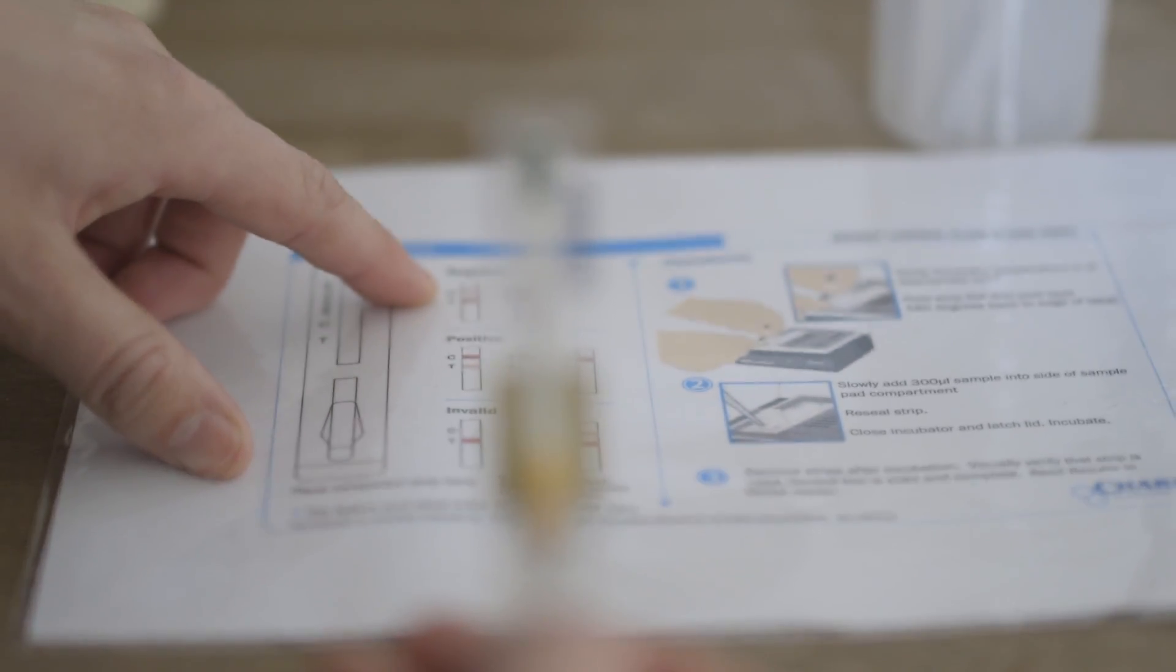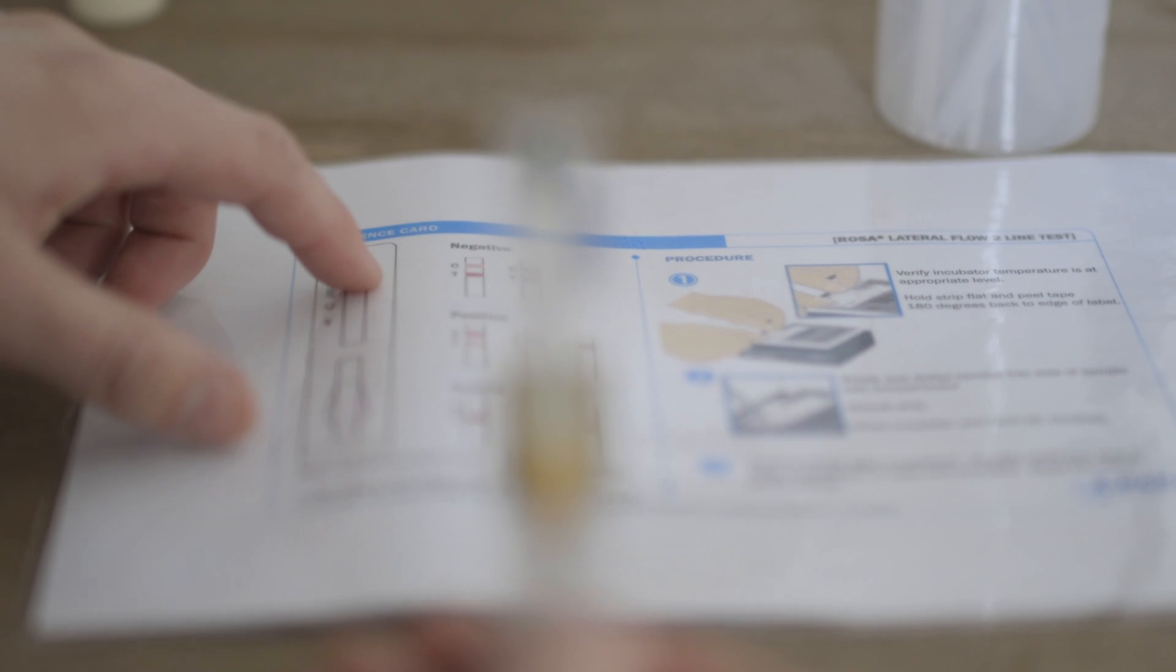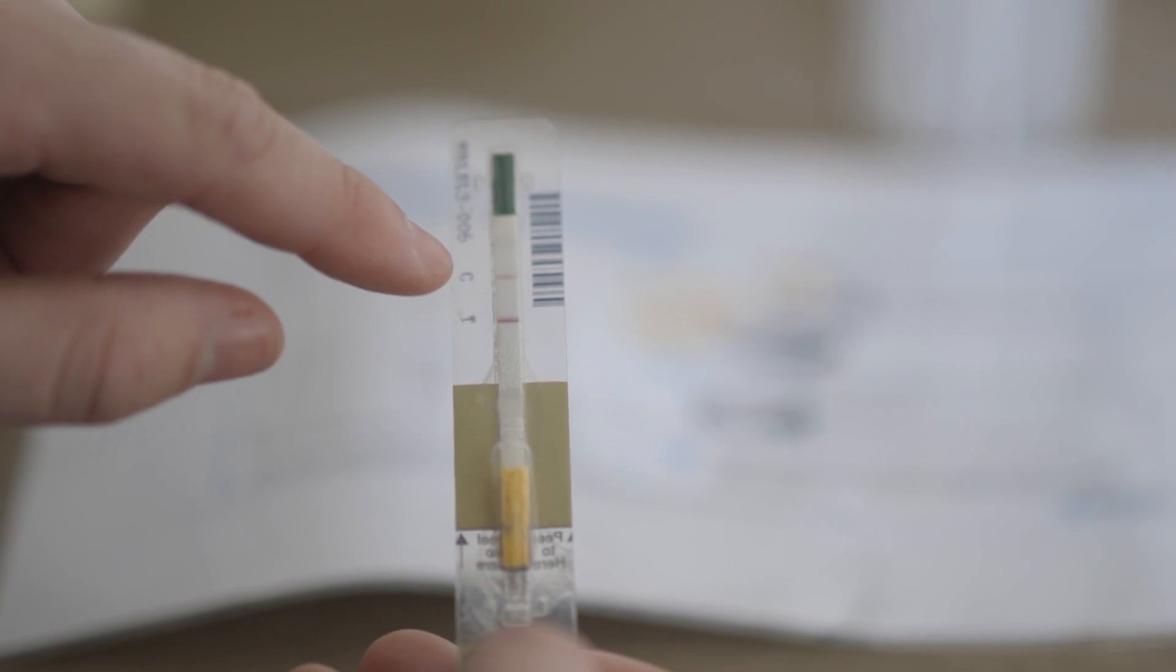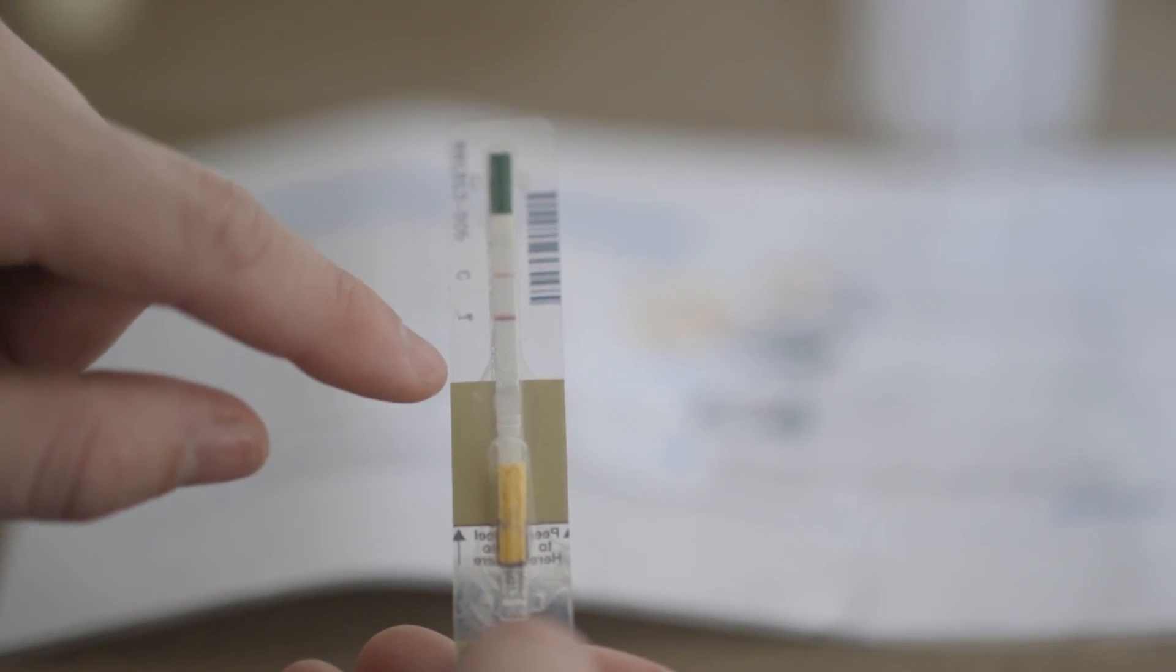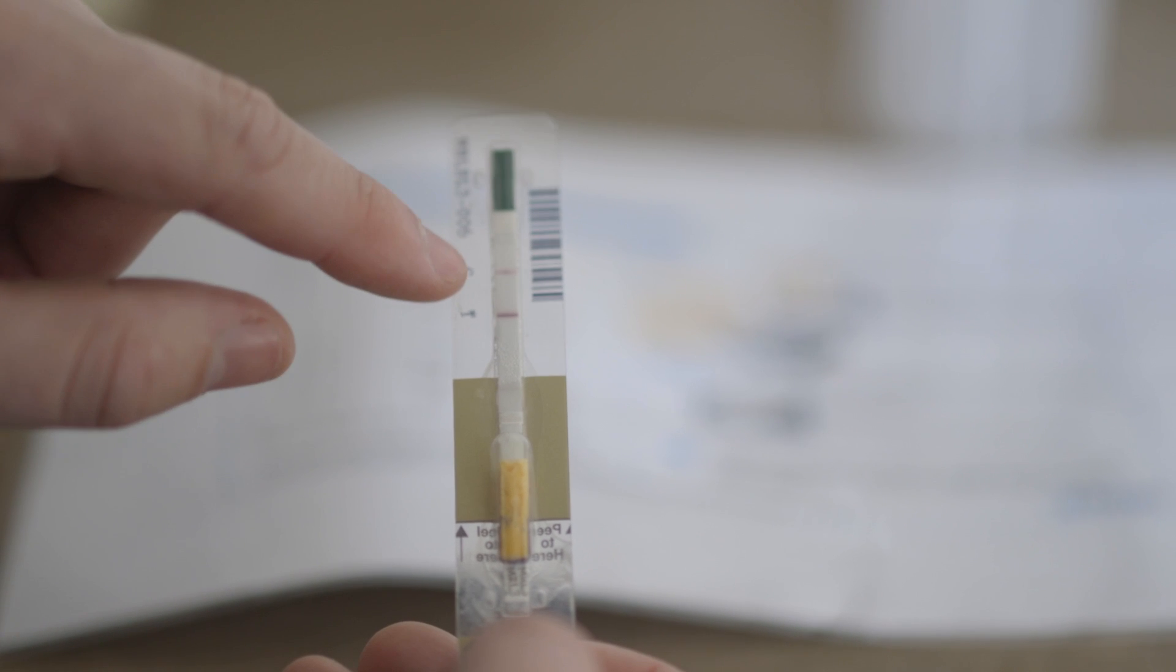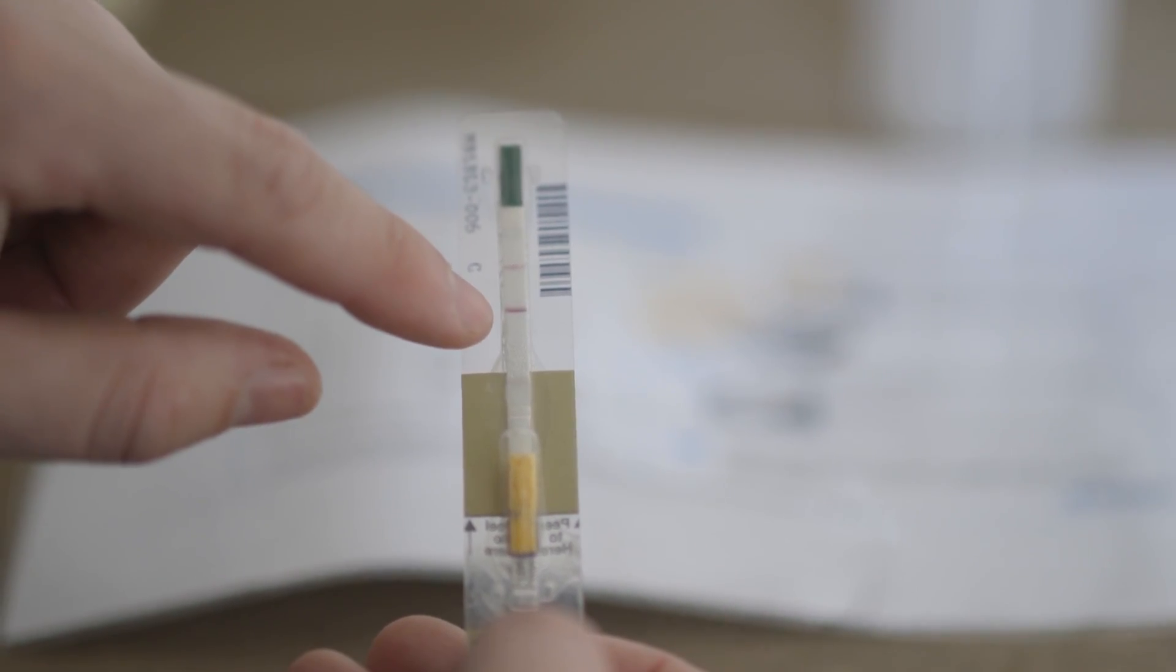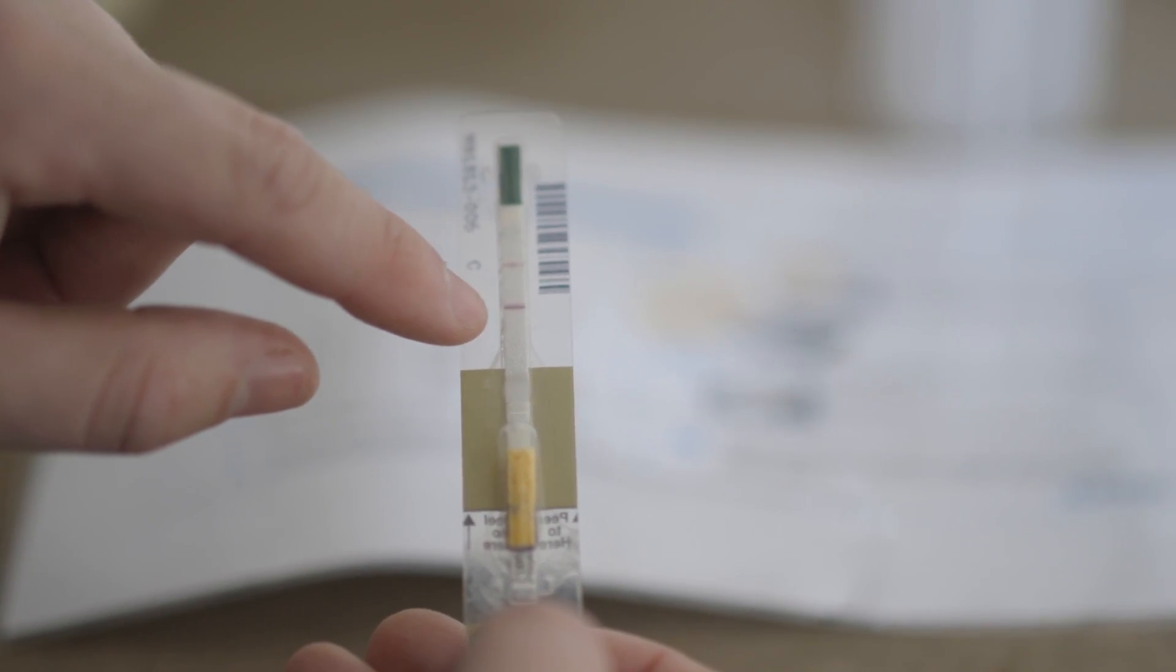A negative example is on the top of our reference guide here. You can see on this example, the T line or the test line is much darker than the control line.